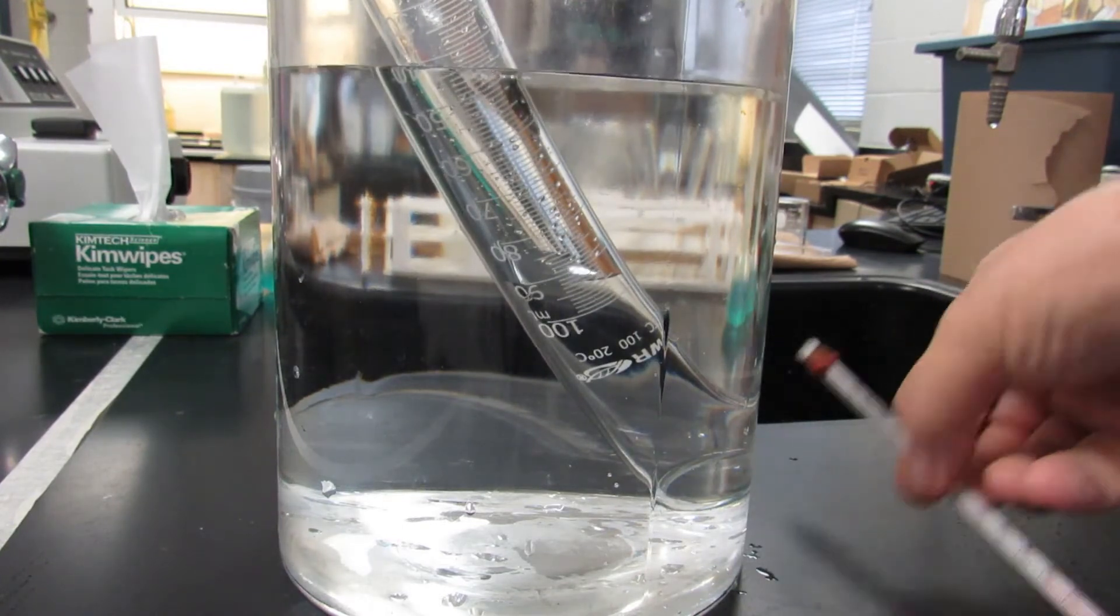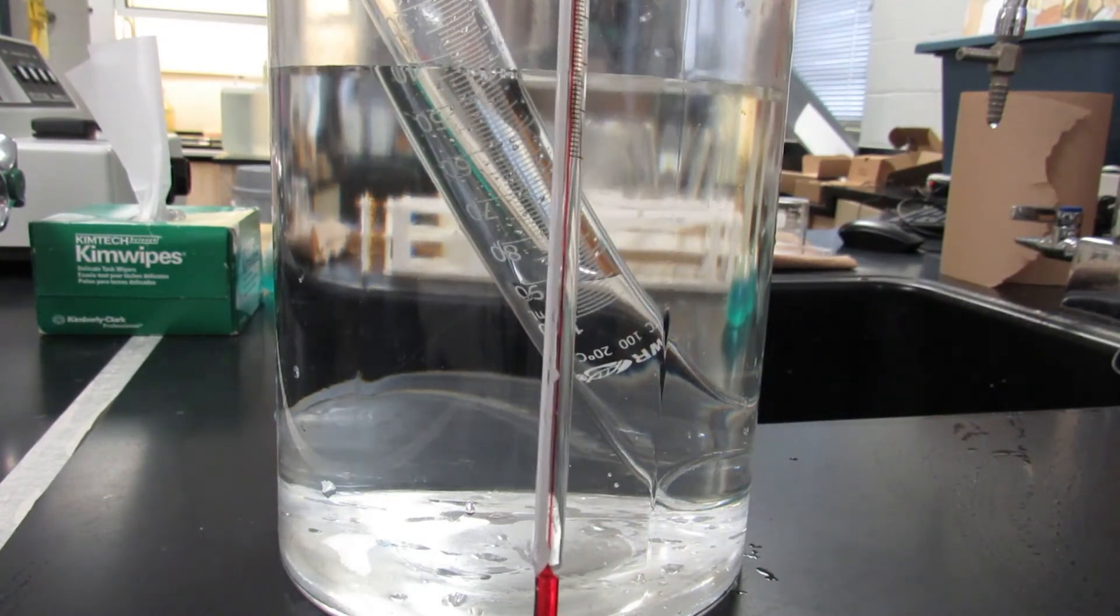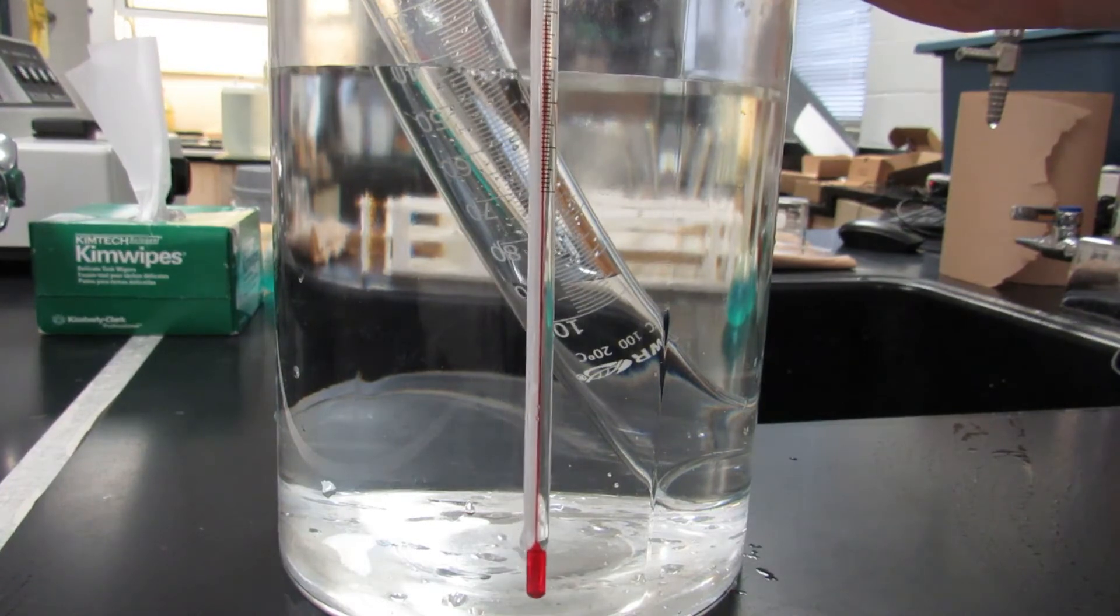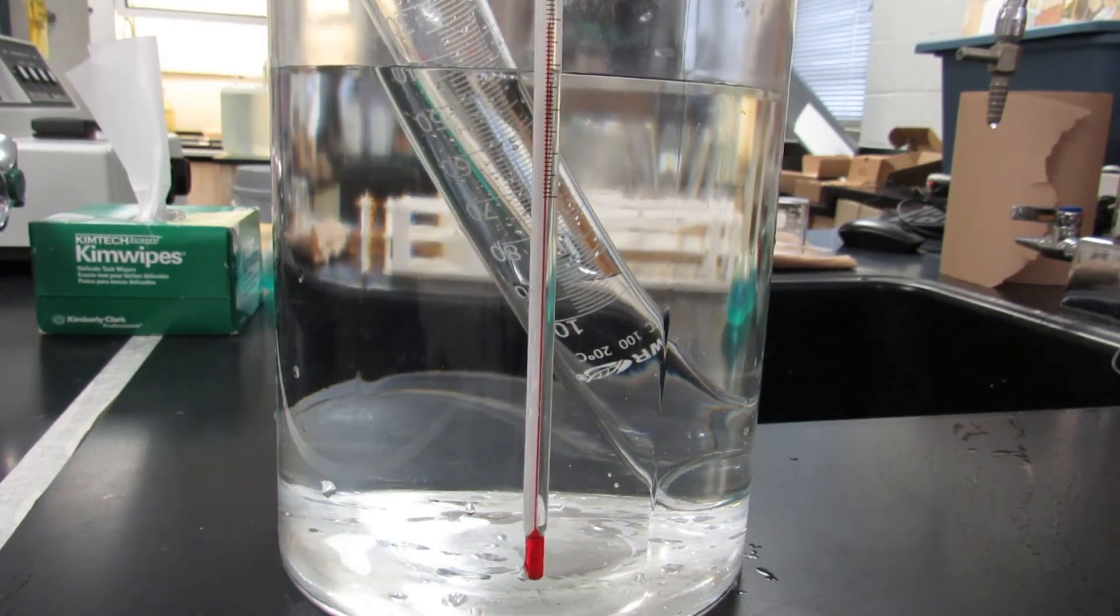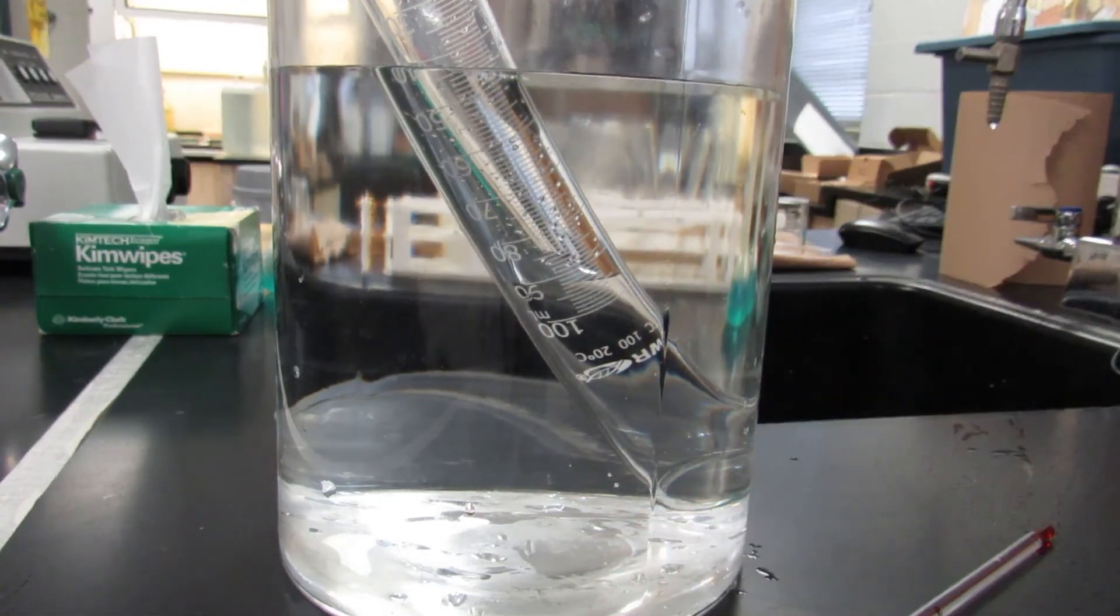And then I need to grab the thermometer. When I read the thermometer, I had 19.4 degrees Celsius in the room, so that's going to be the temperature of my gas. That's it.